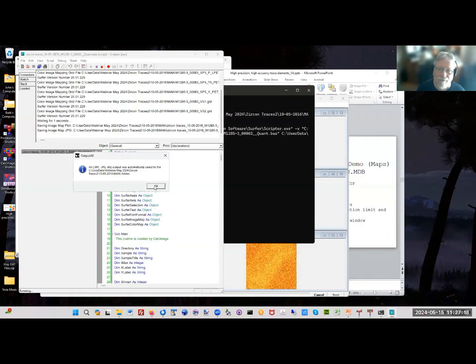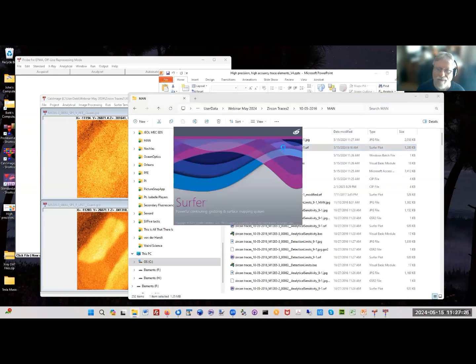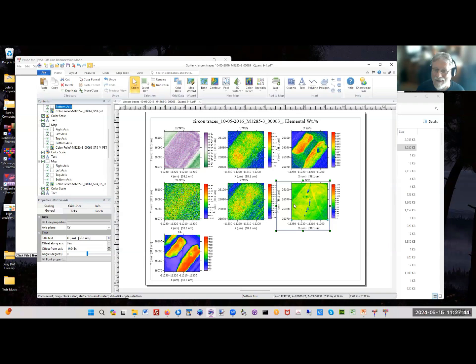And I should point out that you can go to this map now and you can reopen it. And now you can customize it as much as you want. You can say, well, actually, I don't like that color palette. I'm going to use, they have something really weird here. Green, purple. Okay. So you can mess around with it.